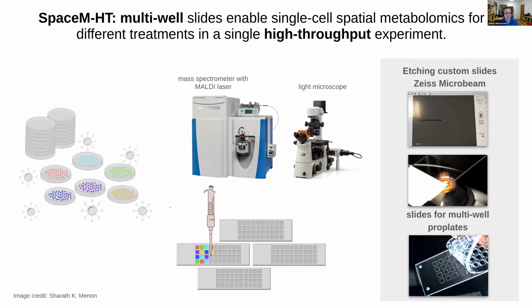This is something that a colleague, Sharat, is working on at the moment. He's doing some CRISPR knockdowns or CRISPR modifications to some cell lines. I'm not exactly sure what he's doing. As a format, we're using regular slides, but to see the different wells, we have these ProPlate things. So there's this silicon layer and a plastic thing that clips on. And I replaced the felt pen marks because I worked previously at EMBL, and I knew that there was a more or less unused microdissection laser dissection microscope sitting around. So we're making these custom slides for this process.